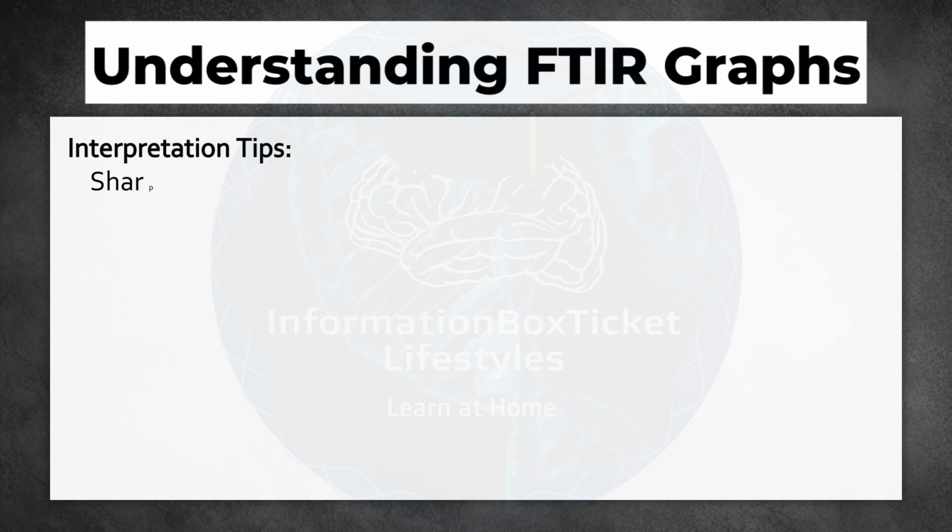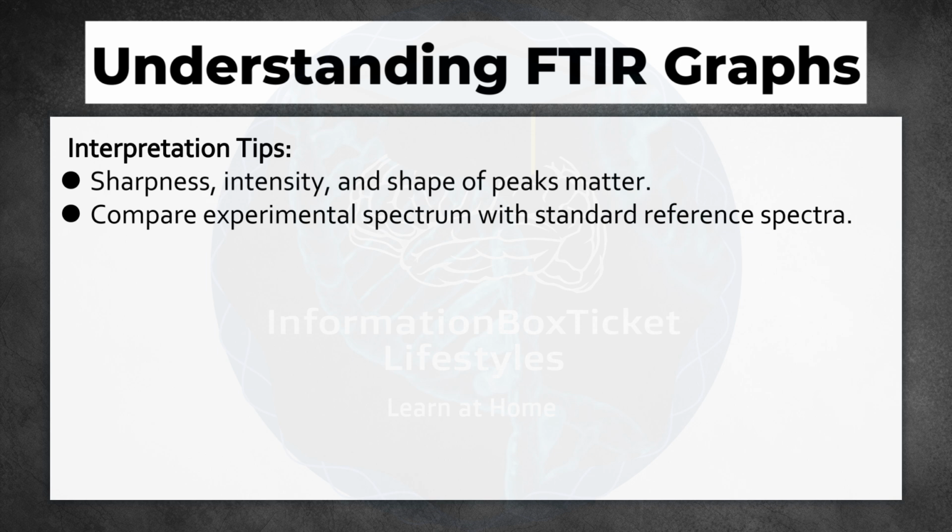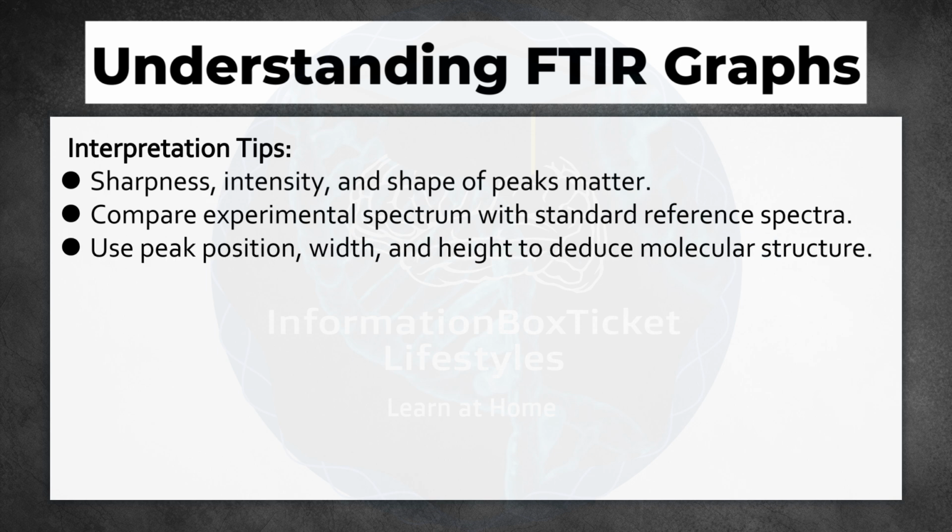Interpretation tips. Sharpness, intensity, and shape of peaks matter. Compare experimental spectrum with standard reference spectra. Use peak position, width, and height to deduce molecular structure.